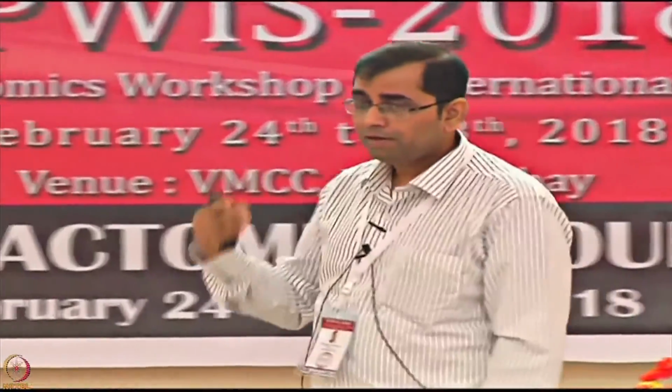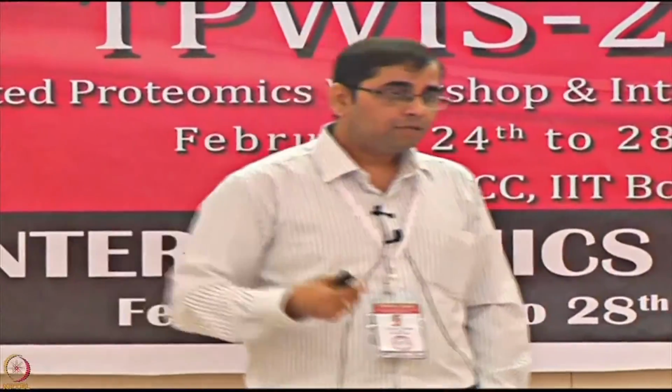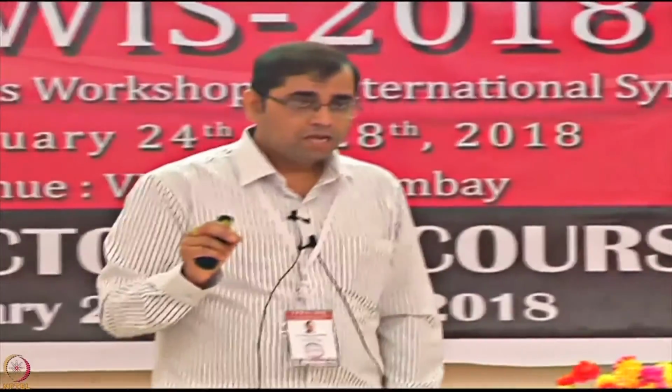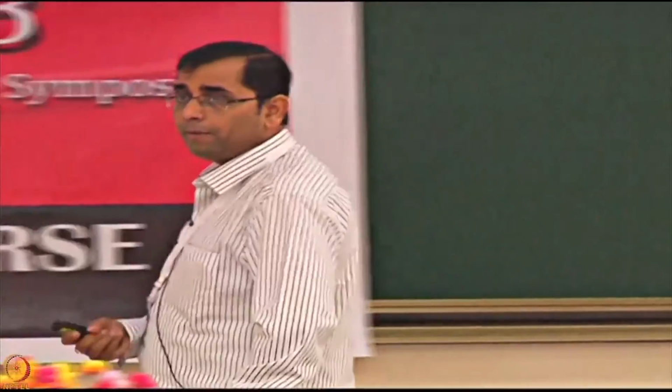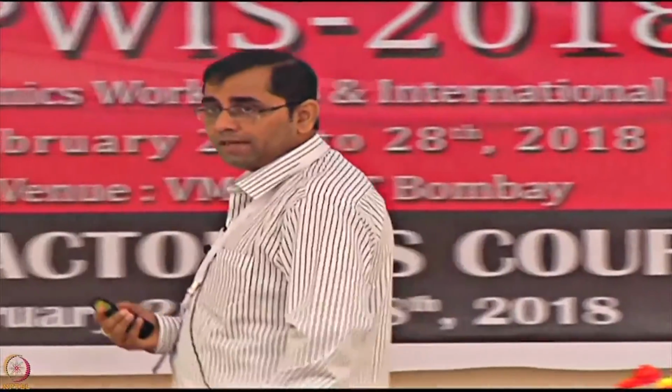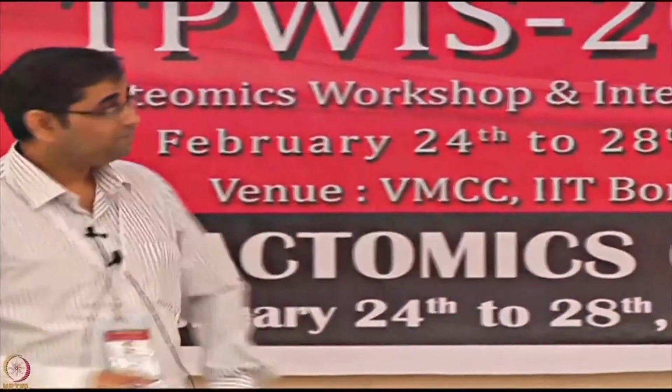That's where people in the Josh lab are now following up the work, building a new type of SPRI platform where HaloTag based chemistry could be used with the chloroalkanes, and then probably that will have much more robust signals, which is what is required for low abundant proteins in the clinical sample context. So, this is how technology development takes place. This is one approach you can appreciate could be used for high throughput screening, which I am sure will eventually come to the market.